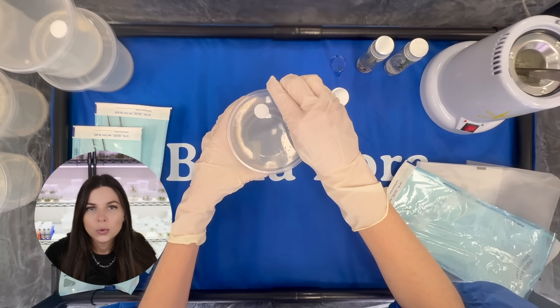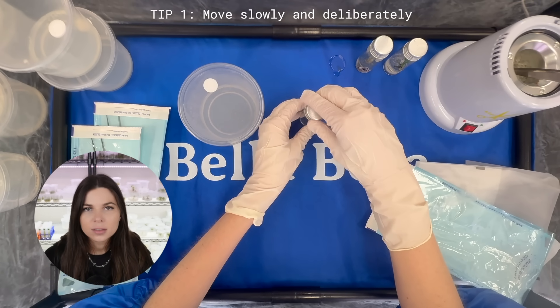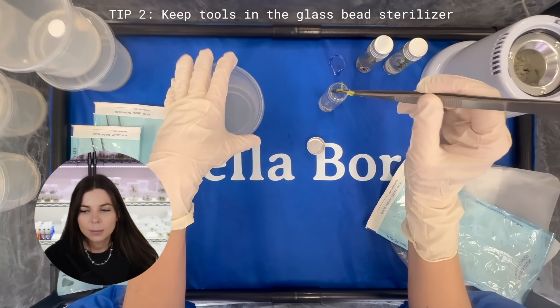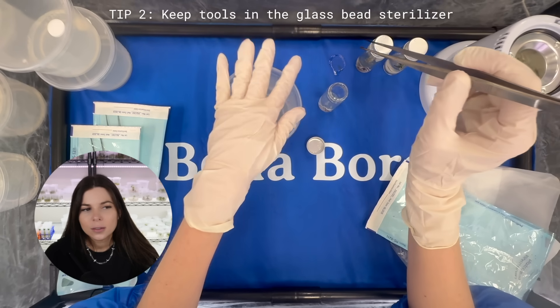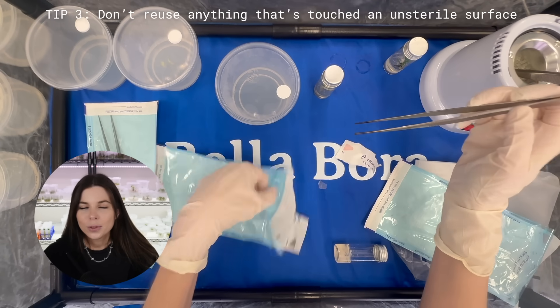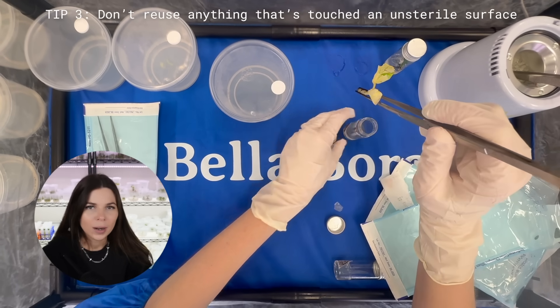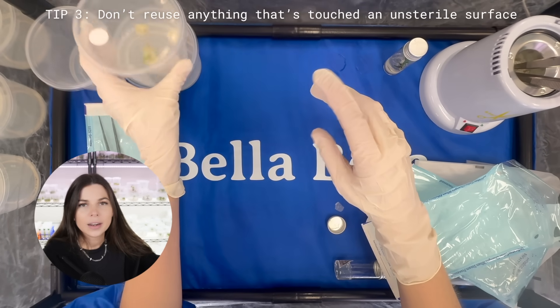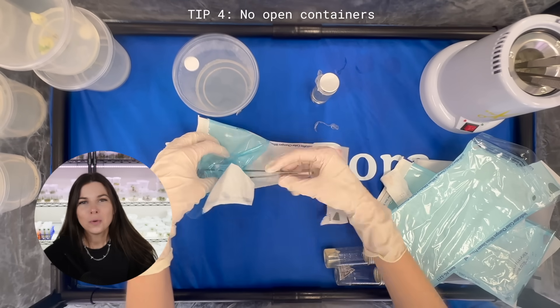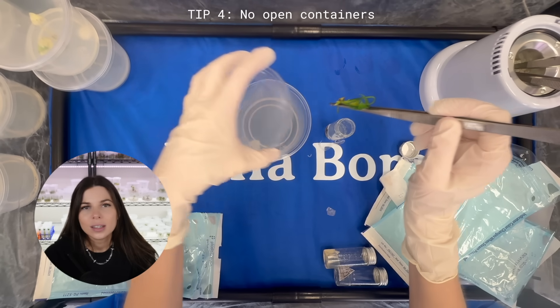Here are four tips for doing this so you don't contaminate everything. Tip one: move slowly and deliberately — quick movements disturb the air and defeat the purpose of the still airbox. Tip two: if you have to put the forceps down, put them into the glass bead sterilizer, not on the surface of the still airbox. Even though we sprayed it with alcohol, it's not technically sterile. Tip three: don't reuse anything that's touched an unsterile surface — that's why I recommend sterilizing multiple sets of forceps beforehand. I'm actually using three different sets here, one for each plant. Tip four: don't leave the containers open; the less time the containers are exposed, the lower the risk of airborne contamination.